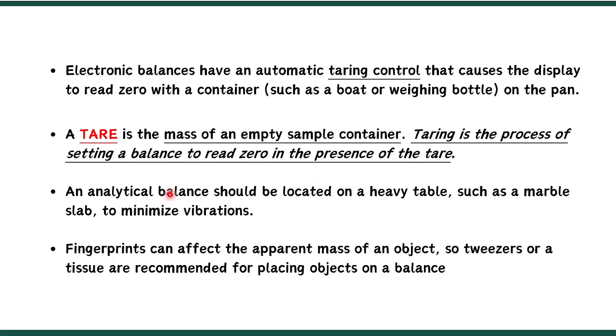And so, where should we place our analytical balance? Can we carry it around to the classroom? Of course not. An analytical balance should be located on a heavy table such as a marble slab to minimize vibrations.